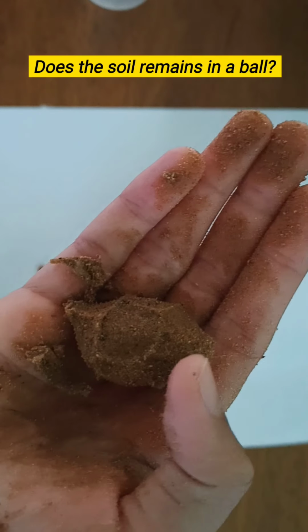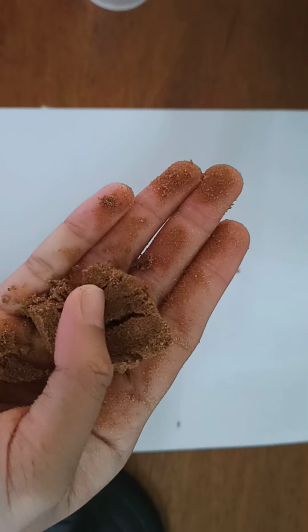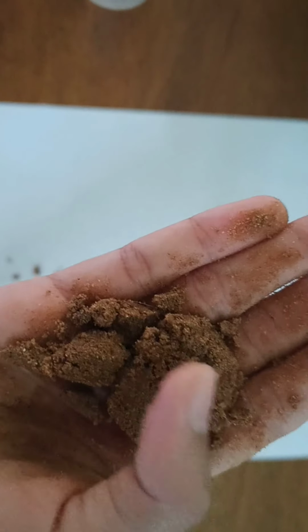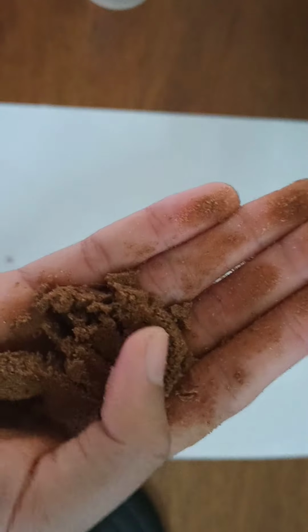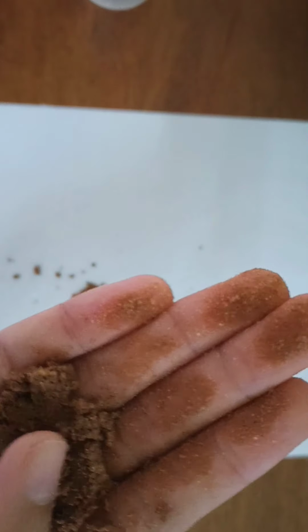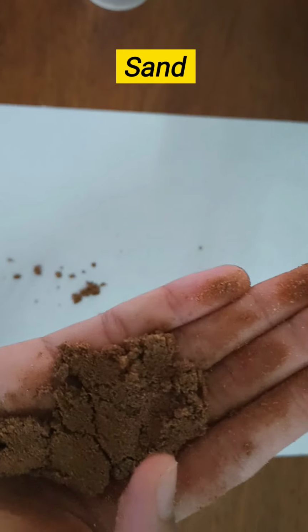Okay, then does the soil remain in a ball? You try to squeeze it. Okay, the sample cannot form a ball. Okay, if the sample cannot form a ball, is the soil too dry? No. Is the soil too wet? No. So this is a sand.